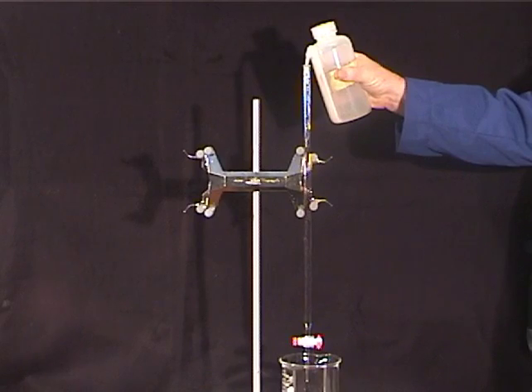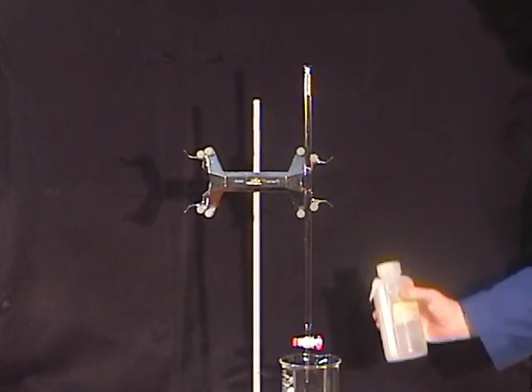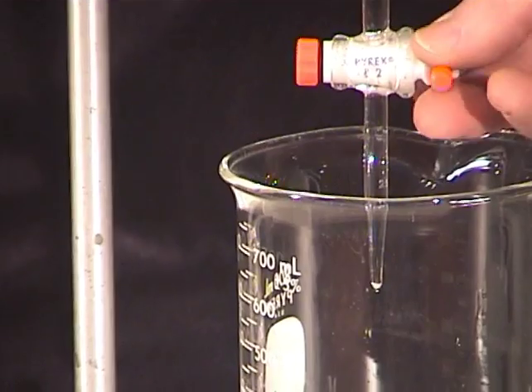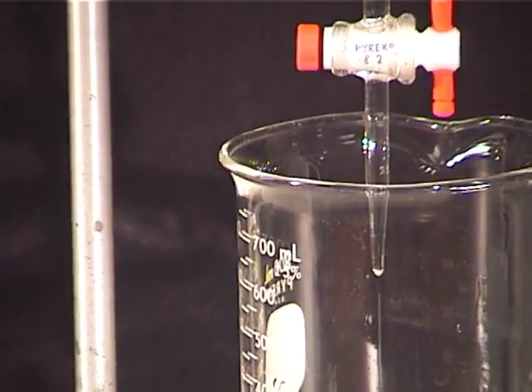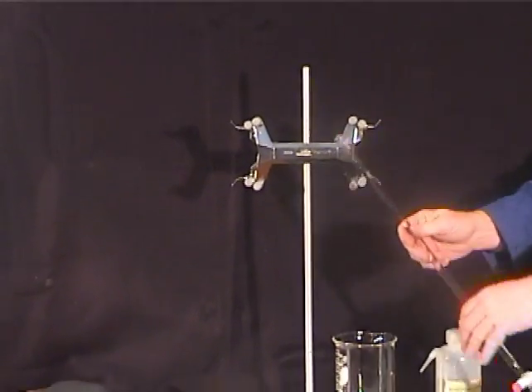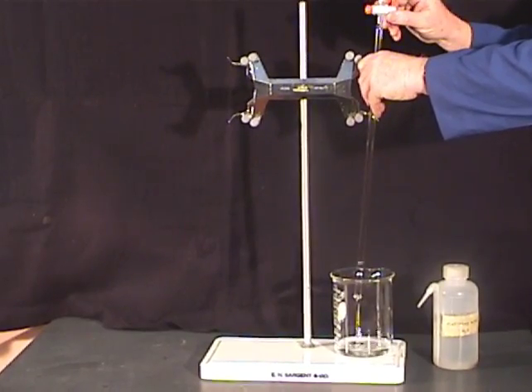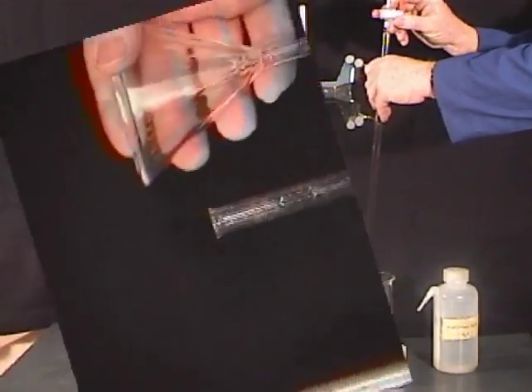The burette is a long calibrated tube fitted with a stopcock valve and nozzle. To use the burette, first rinse it with deionized water by filling and emptying several times. The rinse water must be flushed out so that its residue does not dilute the reagent to be used in the tube.